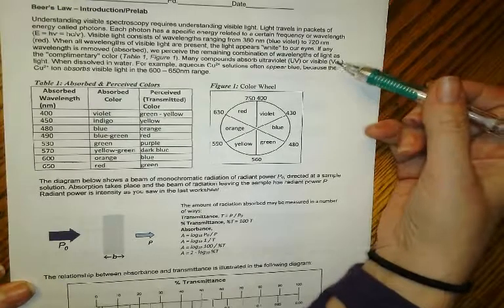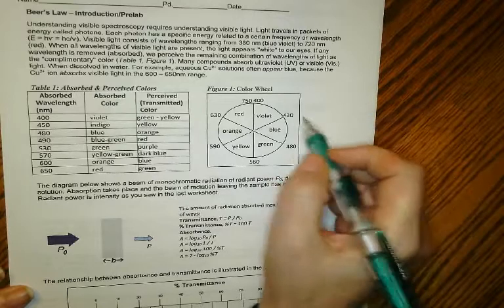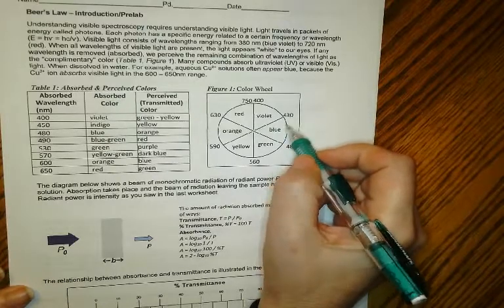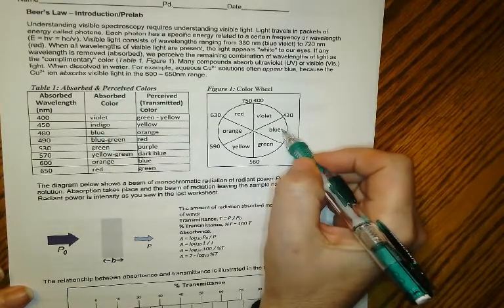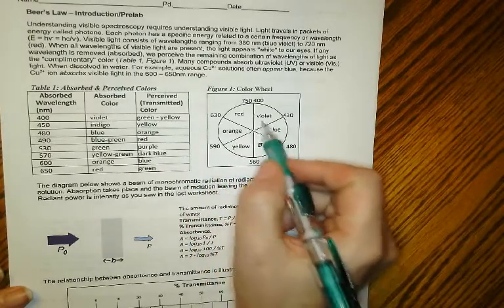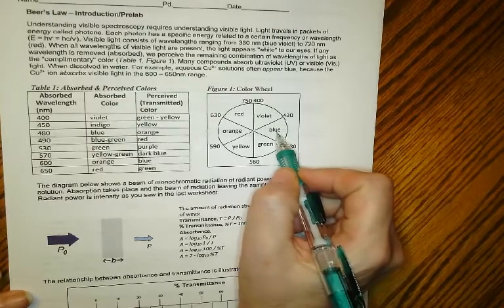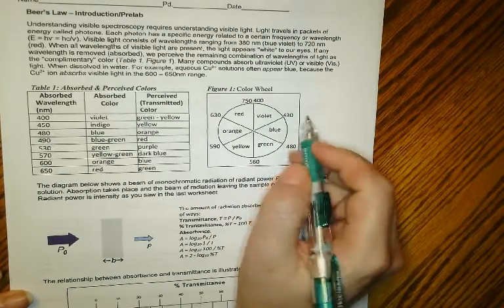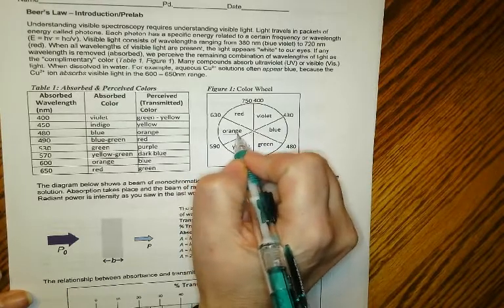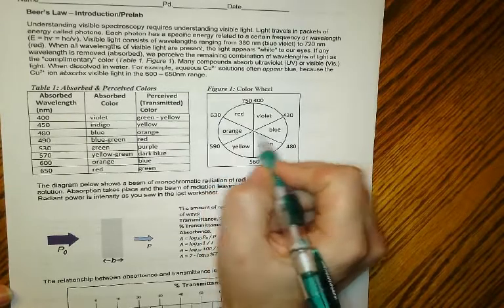Here's just a little overview of what you've already learned. We talked about how what we perceive is the light that's not being absorbed. So all these colors are being absorbed and blue's not, so we perceive it as blue. And usually the wavelength that you want to use on a colorimeter or a spectrometer is orange. It's the opposite on the color wheel.